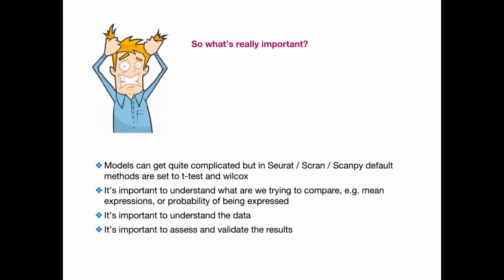So, do you have to know all the statistical models and understand every step for all of these tests? I would say it's good to understand the test that you choose to run. You should read up on and understand what it does so that you can interpret the results.